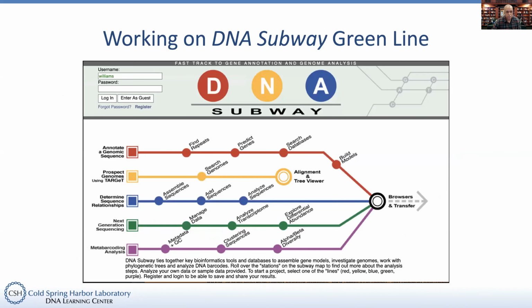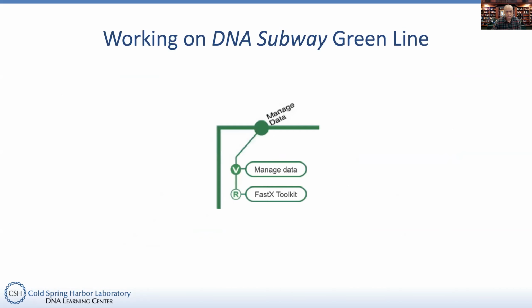Okay, so far in DNA Subway, we've done a number of things. We've talked previously about how we get that data, how we manage it, how we clean it.